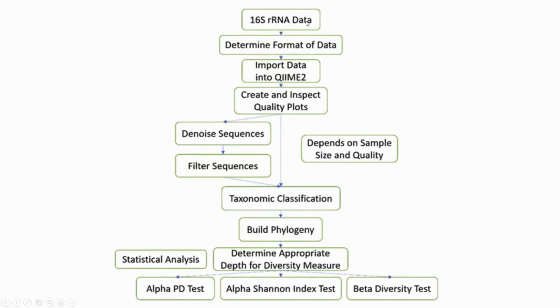We get the data. Then we determine the format. Then we import the data into the QIIME tool. All right.